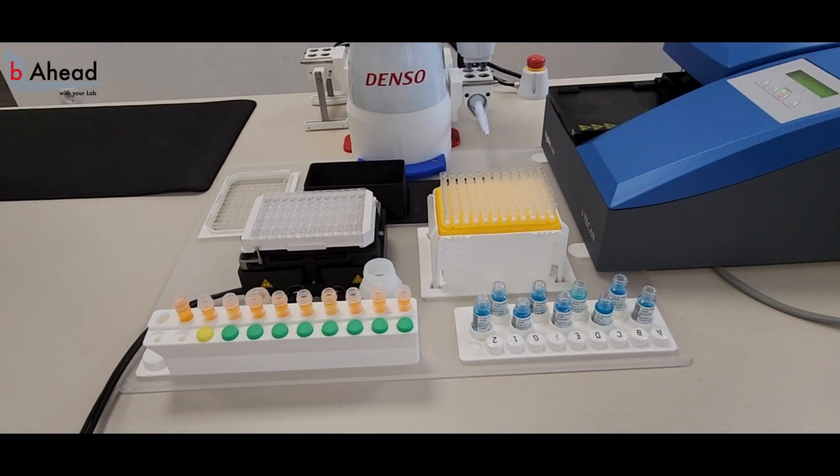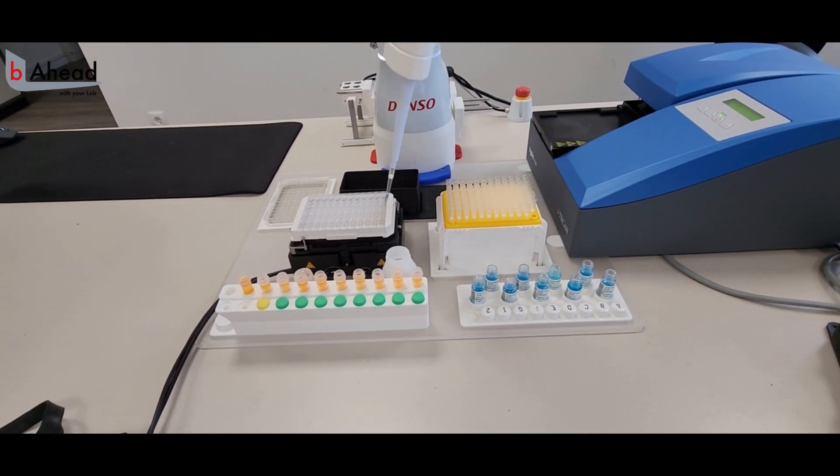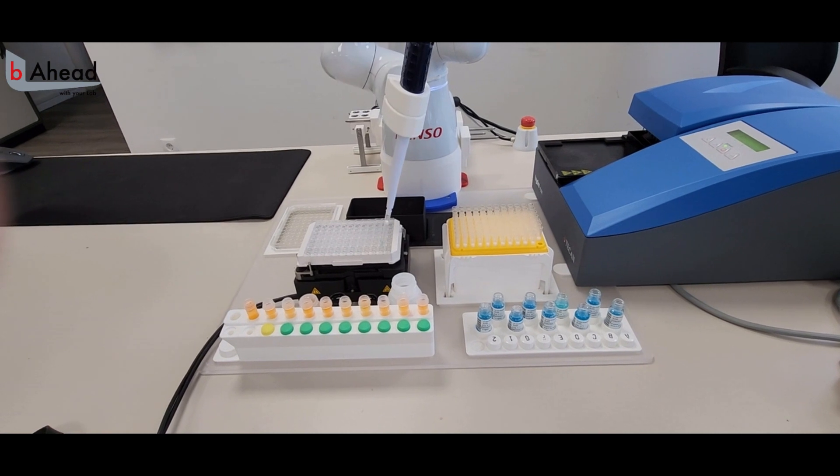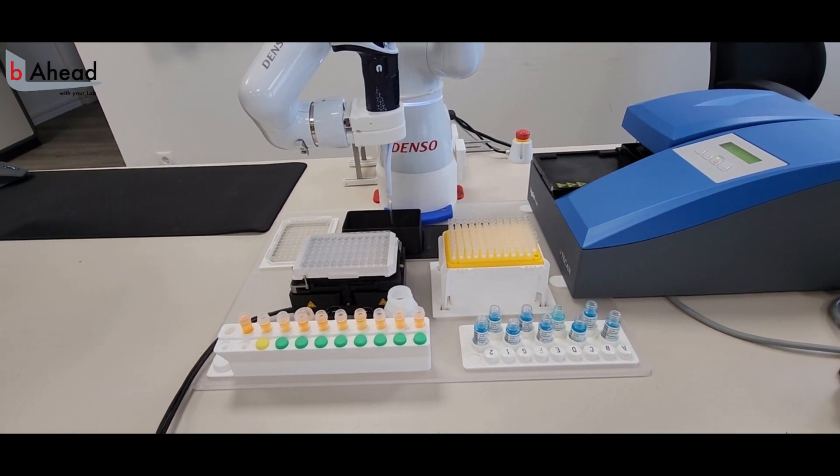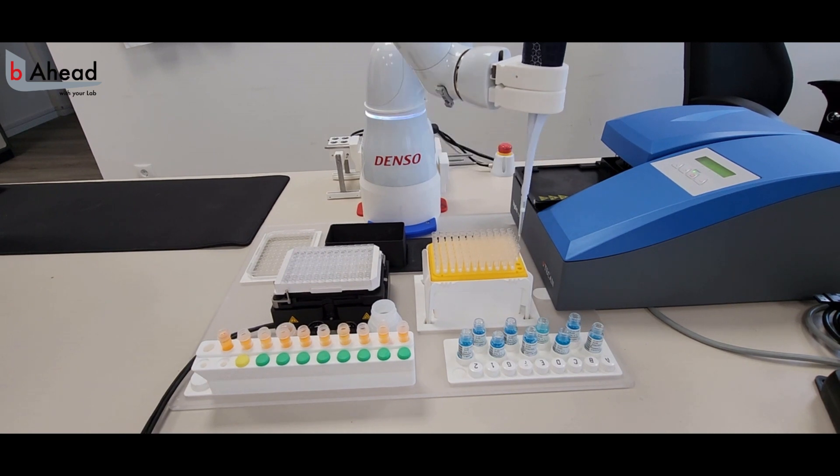After a successful object detection, our buddy starts his work by grabbing the pipette and aspirates the predefined volume from the standards. The order and wells in which the liquids are dispensed are predefined by the user. The pipette is directly connected to our buddy via a Bluetooth connection and can be controlled just like a human would do.